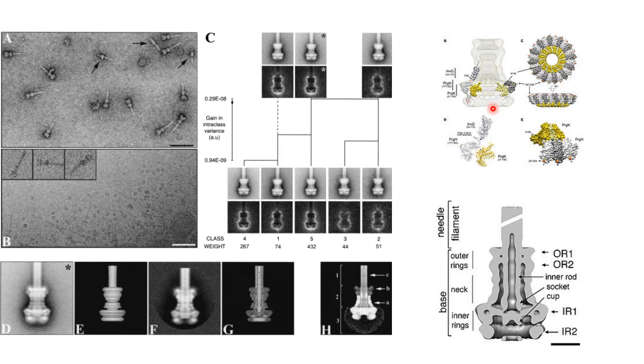One important significance of electron microscopy is that the resolution is much higher as compared to other microscopic techniques. The magnification which we produce is also of a higher order as compared to other light-based microscopic techniques. Another important significance is that a much more detailed three-dimensional structure of the proteins or other molecules or other structures could be reconstructed by using electron microscopic techniques. So these are some of the important aspects pertaining to electron microscopy.